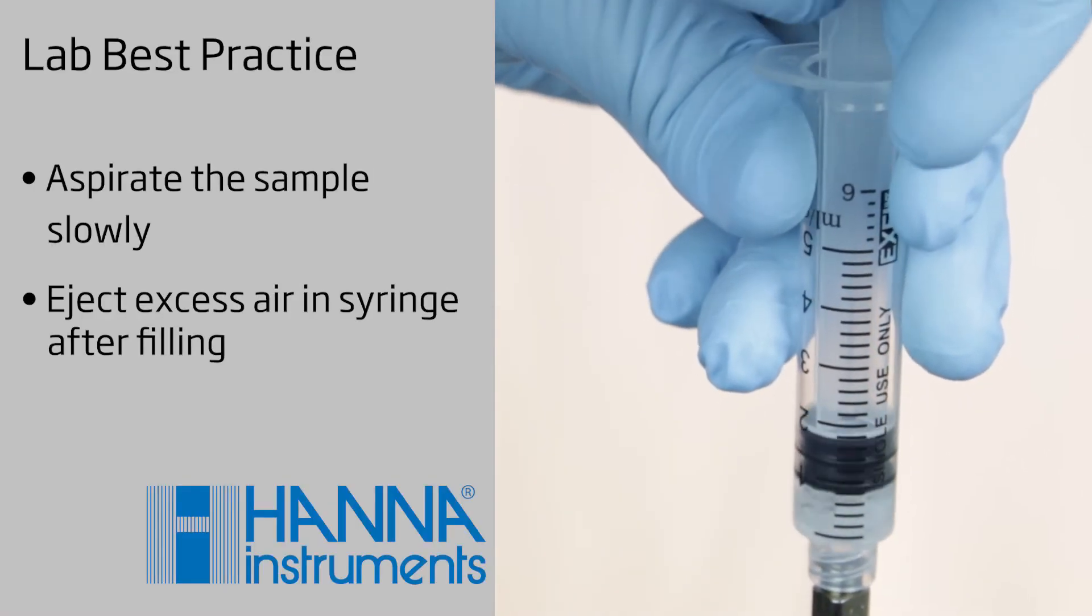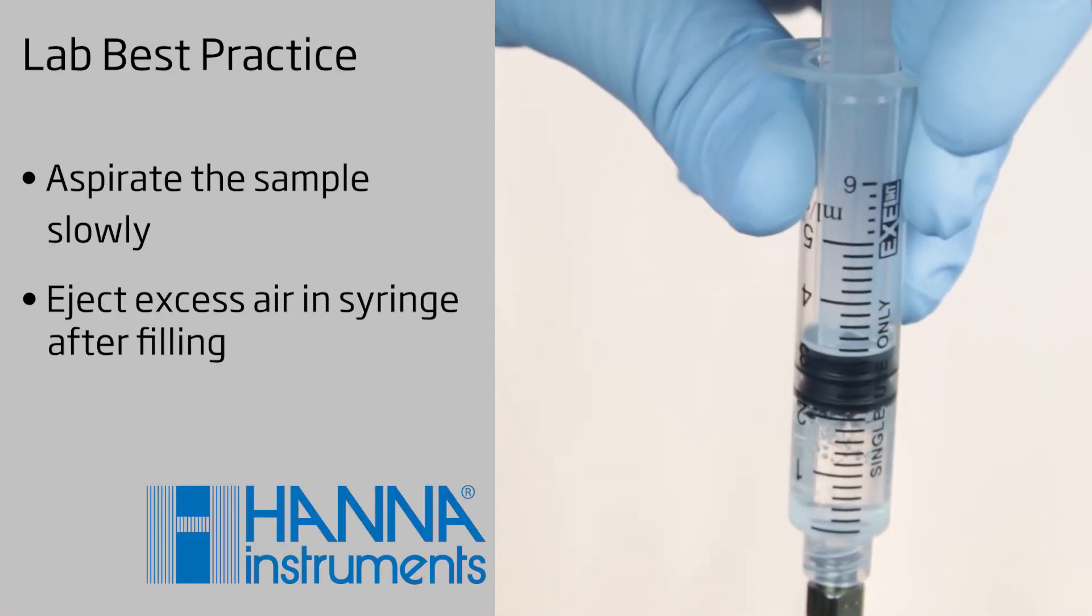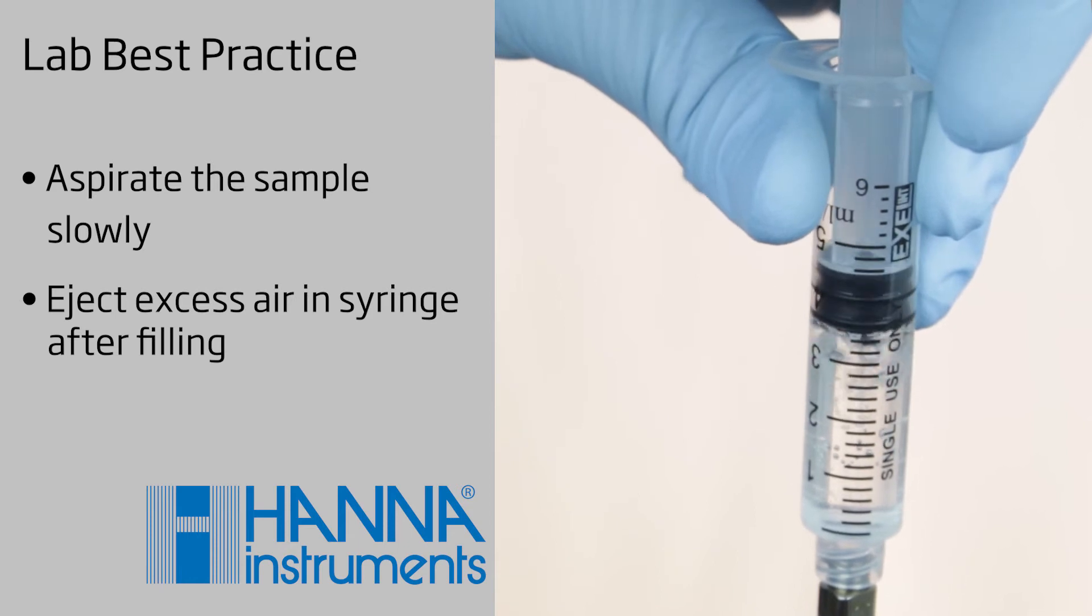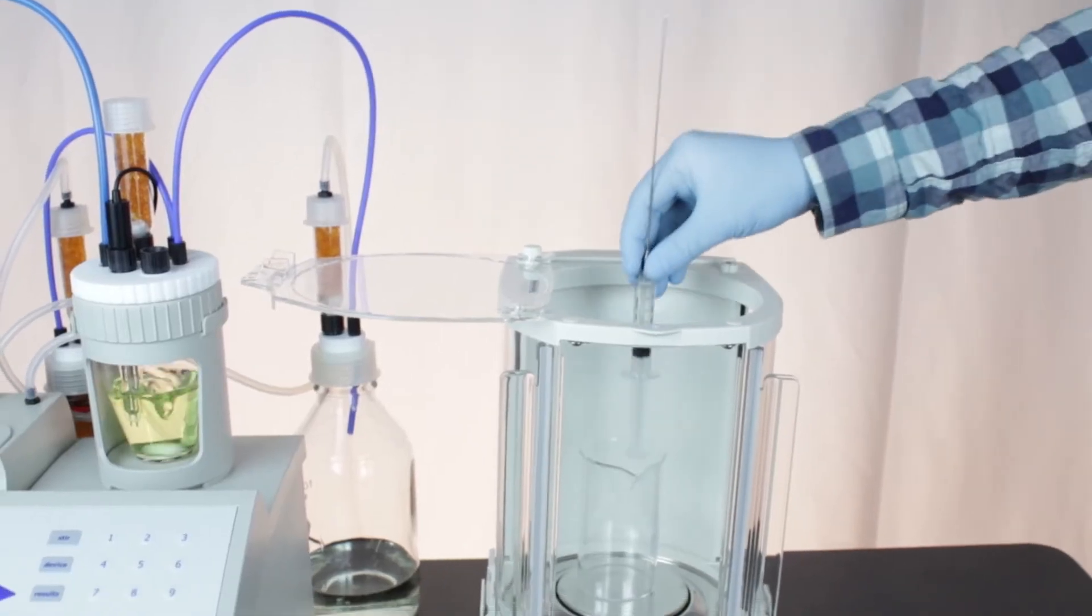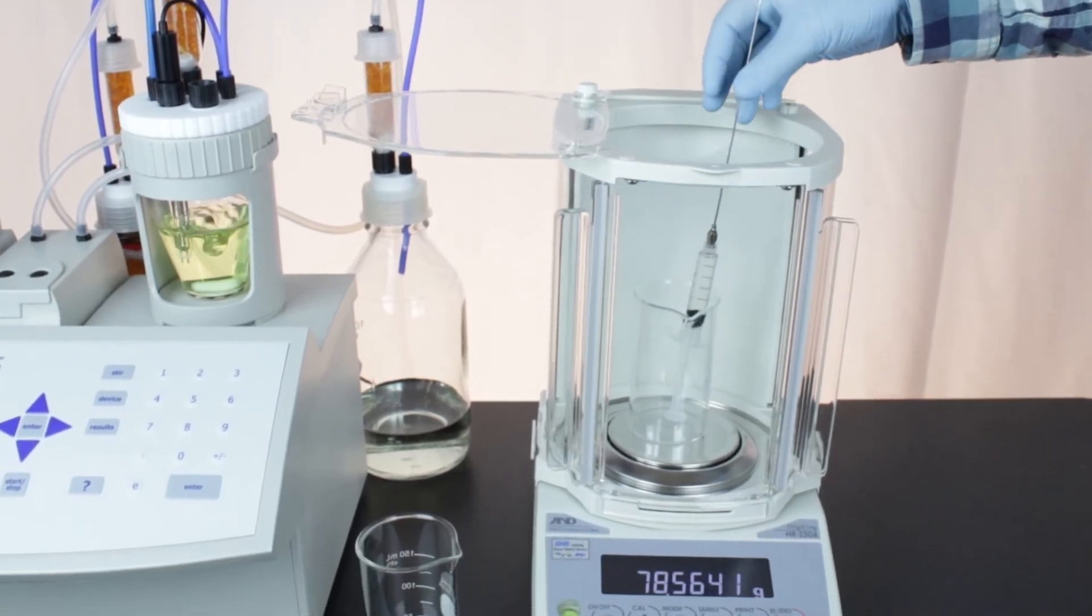Don't worry about getting more than you need, we'll back-weigh the syringe to ensure that we get the precise amount of sample we put into the titration cell. To do this, first weigh the syringe with sample on the scale and tare it.